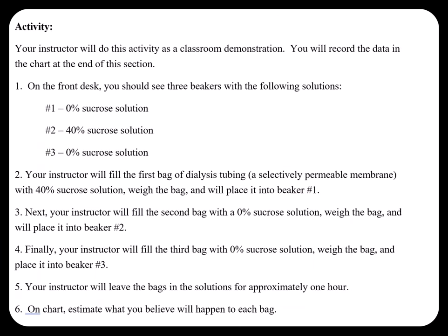The osmosis experiment that we're actually going to do in lab is to take dialysis tubing, which is going to simulate the semipermeable membrane, and then we're going to have beakers of fluid. And inside the beakers, one of them is going to have no sugar, so that's going to be the 0% sucrose. One of them is going to have 40% sucrose. That is way, way thick. There's a whole lot of solute, we call it solute, dissolved stuff inside of that solution. So that's going to be really hypertonic. So you should be able already to tell what's going to happen in that one.